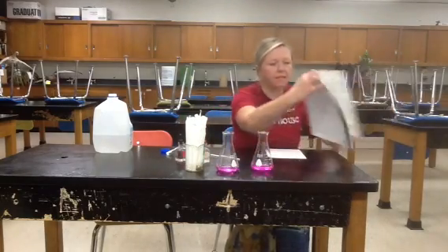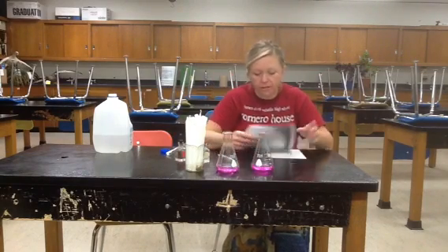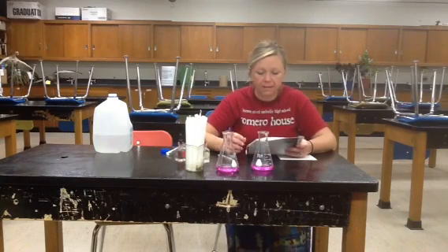Okay, now the next step. For this you're going to have to pick one partner to do the exercising and to do the blowing with the straw, so that you don't swap germs. You're going to exercise mildly by walking in place for 2 minutes. Don't be disruptive. Try to pick a spot in the room somewhere, or maybe we can use the hallway, but don't be loud and silly and disruptive. So you're going to exercise mildly for 2 minutes, and then you're going to repeat step 5 from above and record the number of drops.